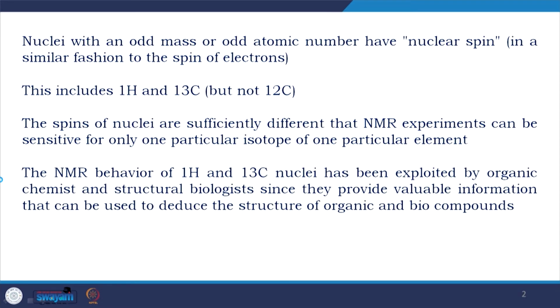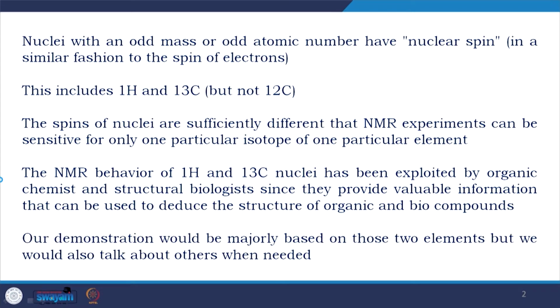The NMR behavior of 1H, the proton, and 13C nuclei has been exploited by organic chemists and structural biologists, since they provide valuable information that can be used to deduce the structure of organic compounds and biocompounds. Our demonstration will be majorly based on these two elements, because in proteins, in any polymer, and in any small molecule they are the major components, but we would also talk about others when needed.